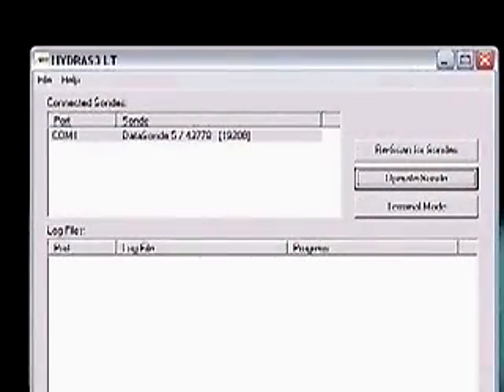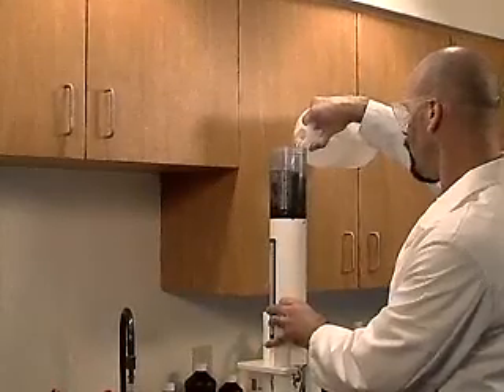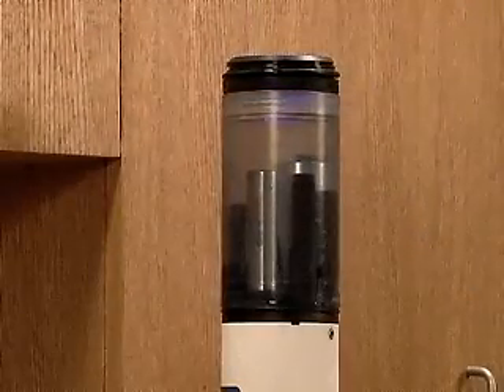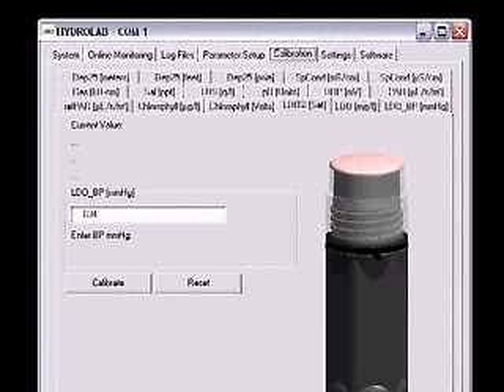Establish a connection to the sonde using Hydrus 3LT and click the button labeled Operate Sonde. Wait for Hydrus to initialize the sensors. Progress can be monitored on the bar at the bottom of the screen. Fill the storage cup over the sensors to the bottom of the threads and place the storage cap on upside down. Do not screw the cap on. When the sonde is ready to operate, click the Calibration tab. Select the LDO % SAT tab. A picture of the LDO sensors should appear on the screen.